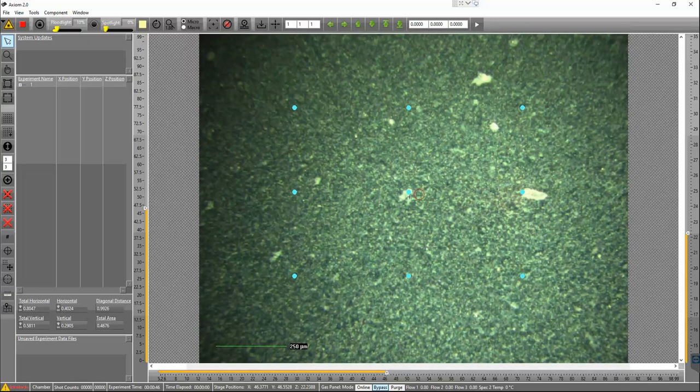Now I can go down here to manually adjust the parameters. I'm going to make these about 0.4 and 0.4 spacing between locations. Okay, so now we have a total of 0.8 millimeters horizontal, 0.8 millimeters vertical, 0.4 distance between each location.